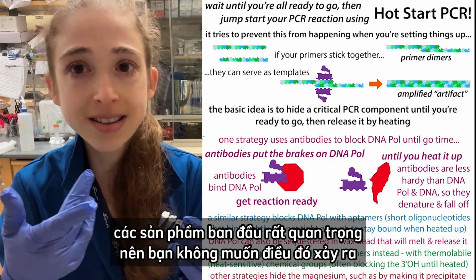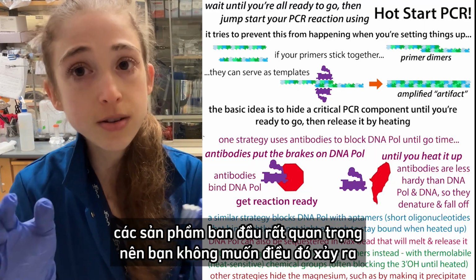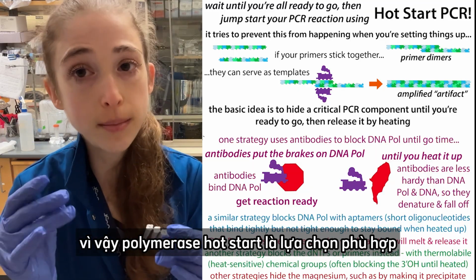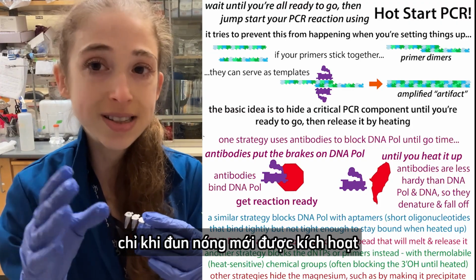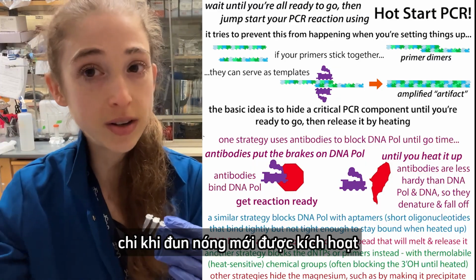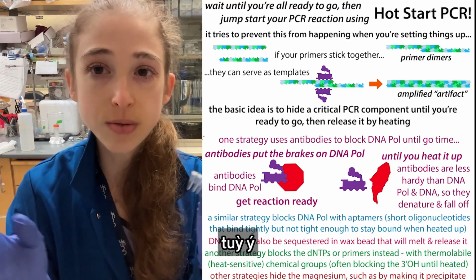And remember, we just said that those beginning products are really important, so you don't want that to happen. A hot start polymerase basically has some sort of blocking group, where not until it heats up is it going to become active. But you can set it up at room temperature or on ice or whatever you want.